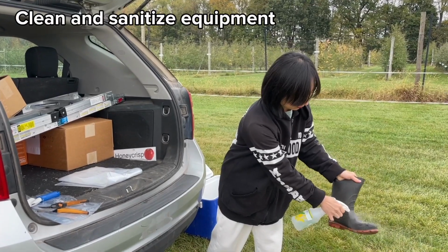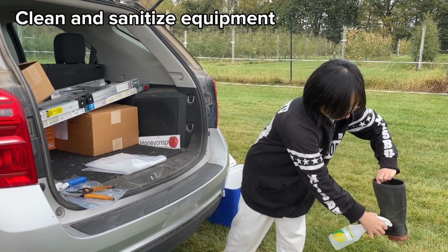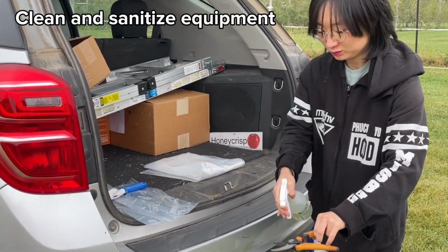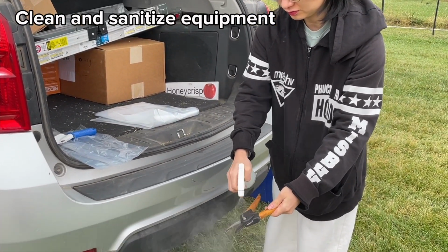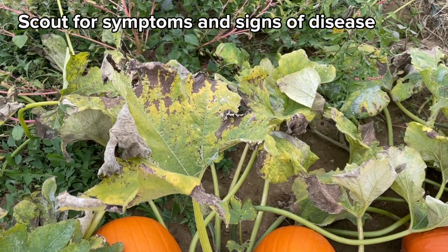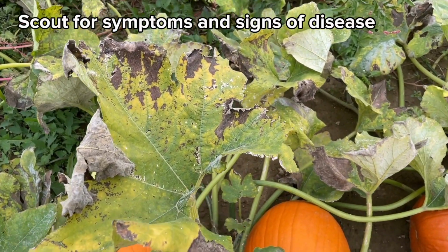Before you enter a field, sanitize field shoes and equipment with 70% ethanol to prevent the introduction of pathogens or cross-contamination. In the field, scout for symptoms and signs.